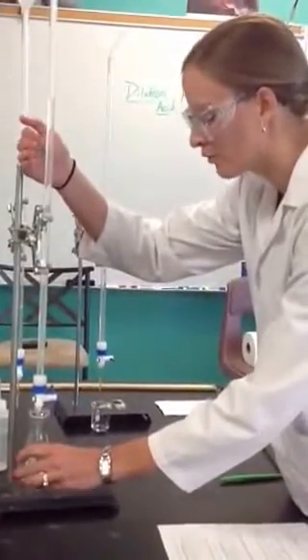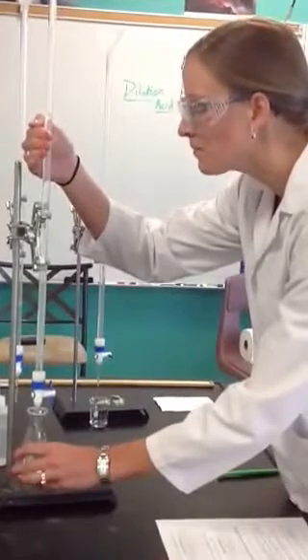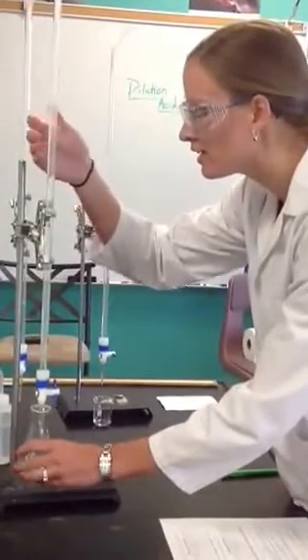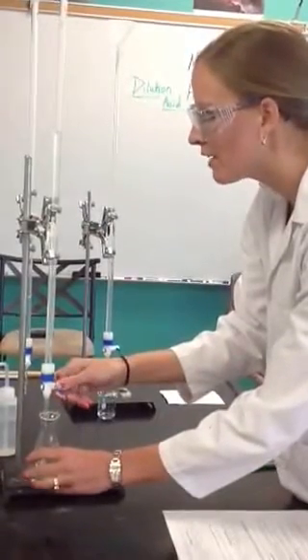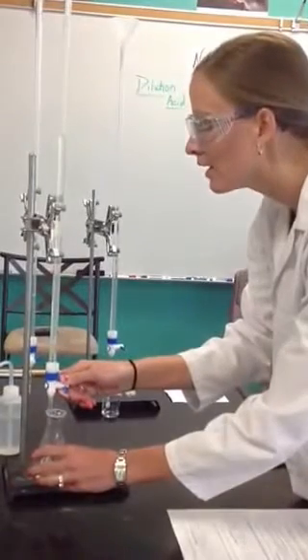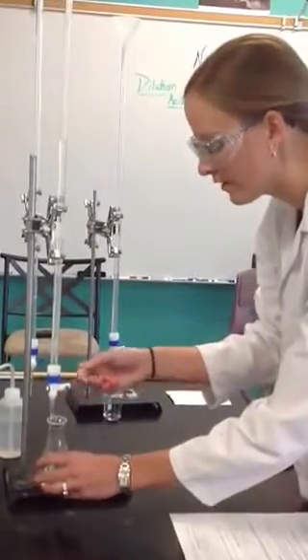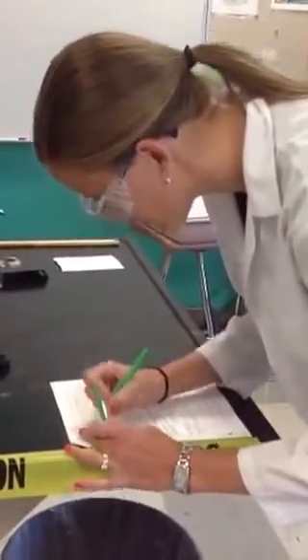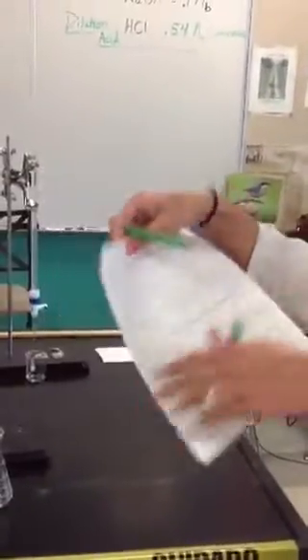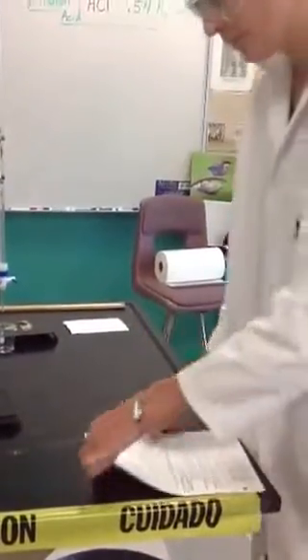Now I'm going to get out 10 mL. I'll keep my hand near the 17 mark so I can read it a little bit better. Once I start getting closer to that 17 mark, I might slow how fast the acid is coming out by turning the spigot at an angle. I got 17.1, so I want to make sure I record that in my table. Now I have 10 mL of acid.